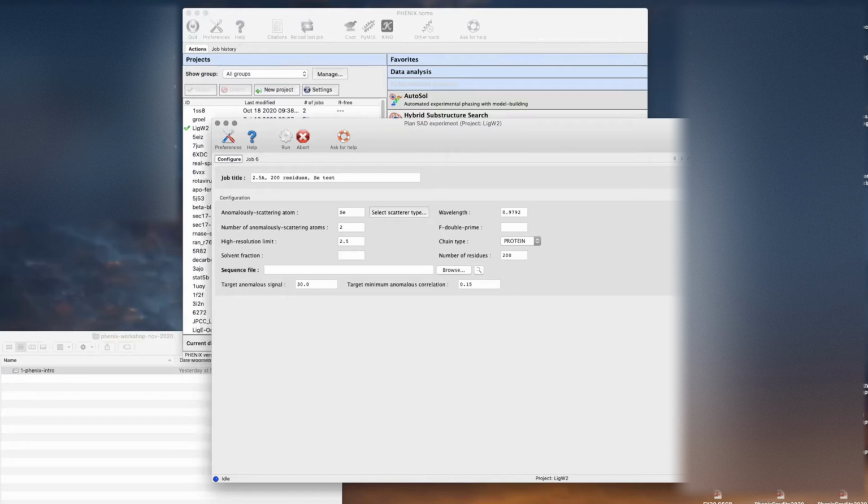One is, how do we know which fields are mandatory? Actually, in this particular GUI, it's not obvious. We don't tell you that. Most of them, we try to tell you like with parentheses or the word optional. So this one, I don't think you would know just by looking. Actually, though, Paul, can you hover over solvent fraction, for example? That'll be instructions, and it might tell us optional. Yeah. Okay. So then you'd be a little bit lucky, and it would just tell you that it's optional.